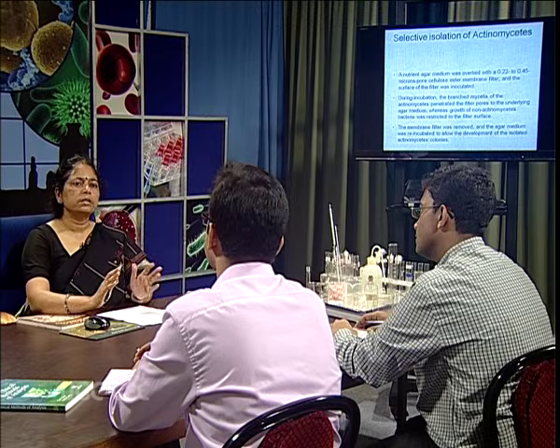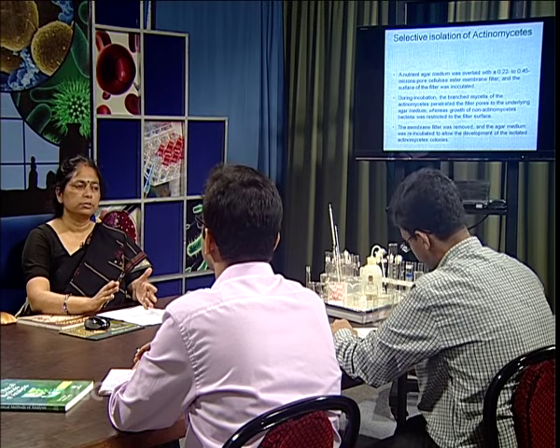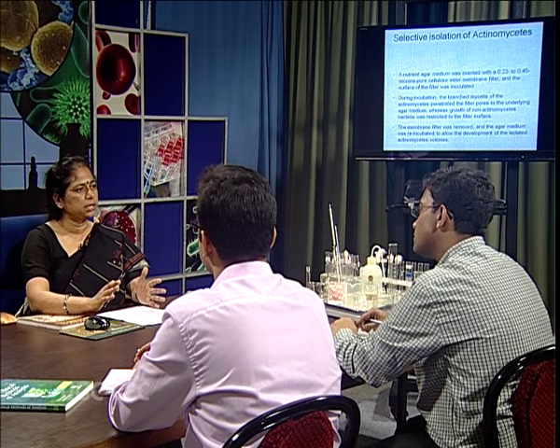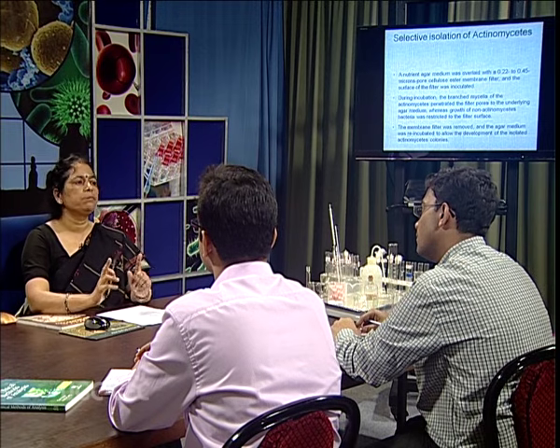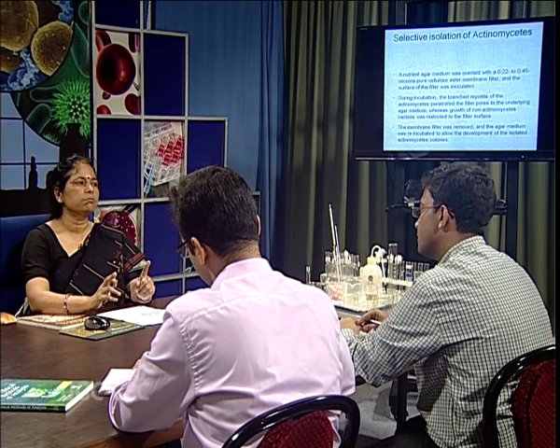So, whatever we have studied today is basically how to isolate the single colony so that we could develop the pure culture of the bacteria, of the fungi, of the actinomycetes, because they are of economic importance. Many bacteria are there which are used in the biotechnological industry, while on the other hand there are many bacteria which cause different types of diseases and we call them pathogens. So, we have to study the bacteria, we have to identify the bacteria, we have to characterize the bacteria, and for all these we need to have a pure culture, and therefore isolation of the single bacterial colonies is very important for the microbiological studies.